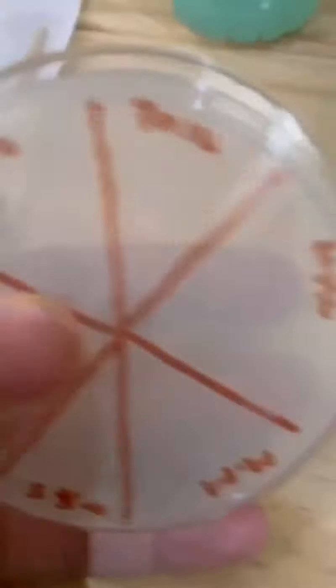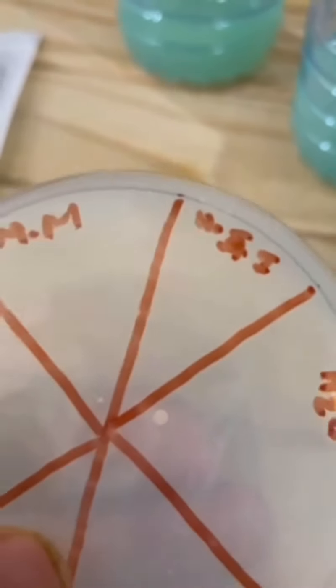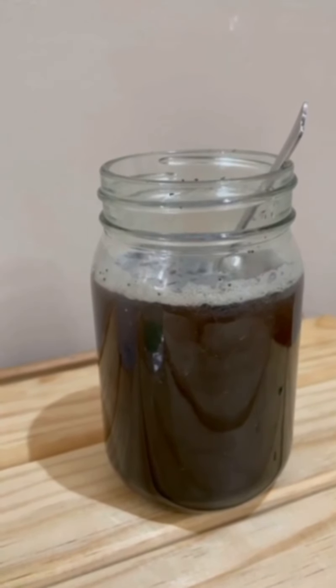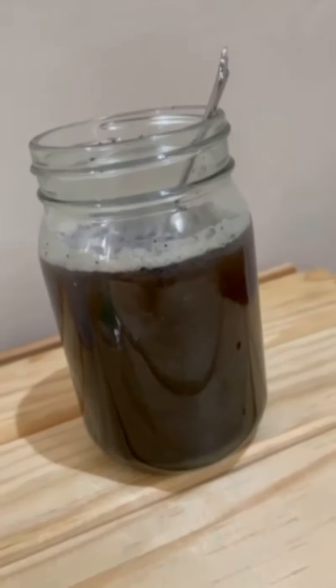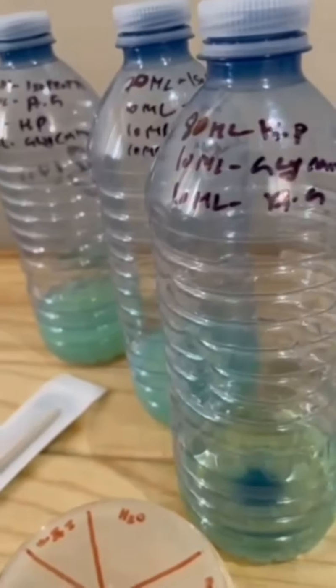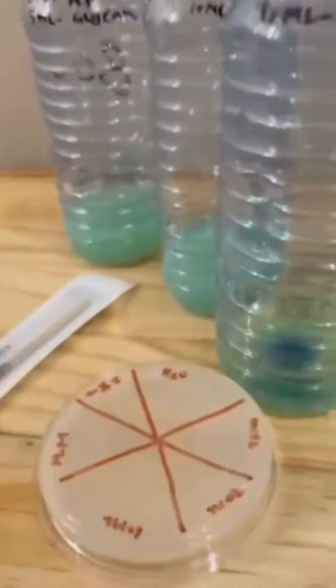Here is my agar plate, ready. These are the 80 ml isopropyl, 70 ml, 60 ml, market made, without active ingredient, and water, and my swabbing stick is ready. These are my 6 controls. This is the solution where I added soil into the tap water. I'm going to swab it on the agar plates, then put 2 drops of every control and see the result after 48 hours at room temperature.